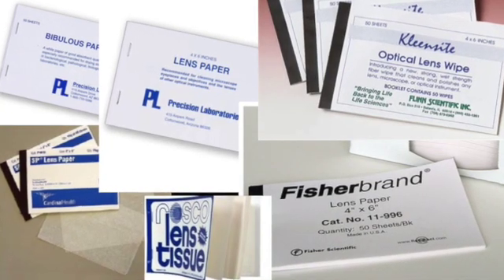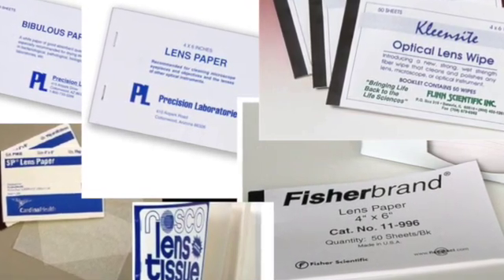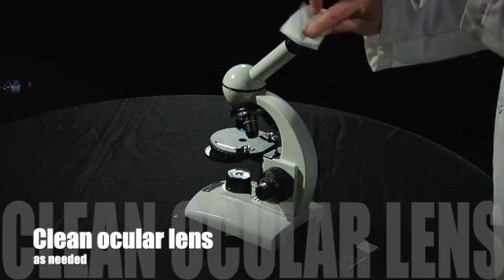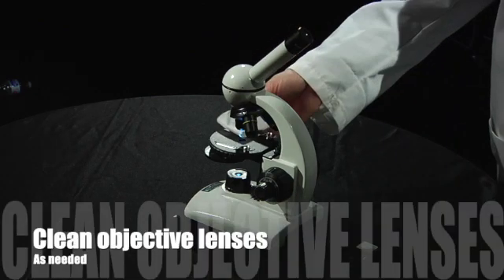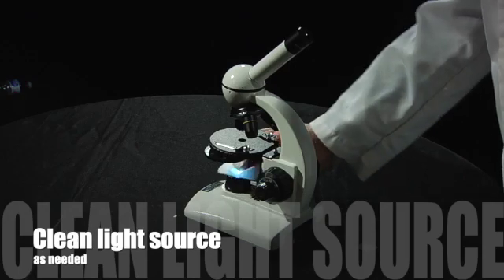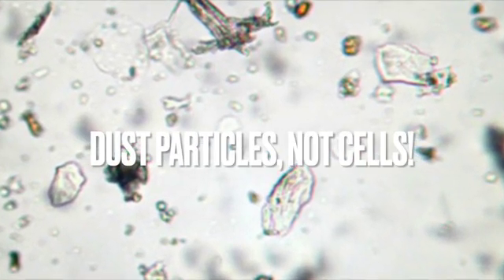You might have lens paper that looks rectangular or it might be in a box — it should say lens paper or Kim wipes on it. You just take one out, fold it a little bit, and rub the lens with it. No cleaning solution is necessary; it's just going to be a very gentle clean. At some point you might need to do the same thing to your other lenses. Also you might need to clean where the light source is, because dust does collect on that light source. Sometimes dust particles people think are cells, so it's a good idea to remove any of that as needed.